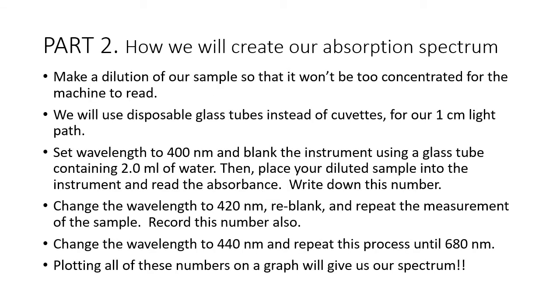Okay, so now we get to parts 2 and 3. Oh, I should say, don't forget to vortex the samples. Each person has a vortex. The dye mixes are quite heavy, and so if you just add it, it won't mix well. So we have to make sure we have a nicely mixed solution before we try to do any spectrum on it. Okay, so we're going to blank the machine with water.